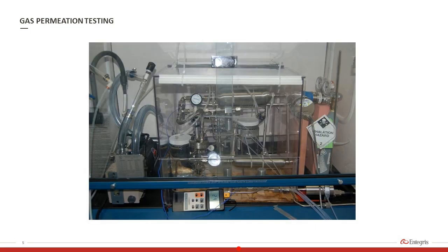This is an image of the actual test apparatus, and although it may not be pretty, it is very effective and allows us to test several different material iterations and to characterize any changes in materials.